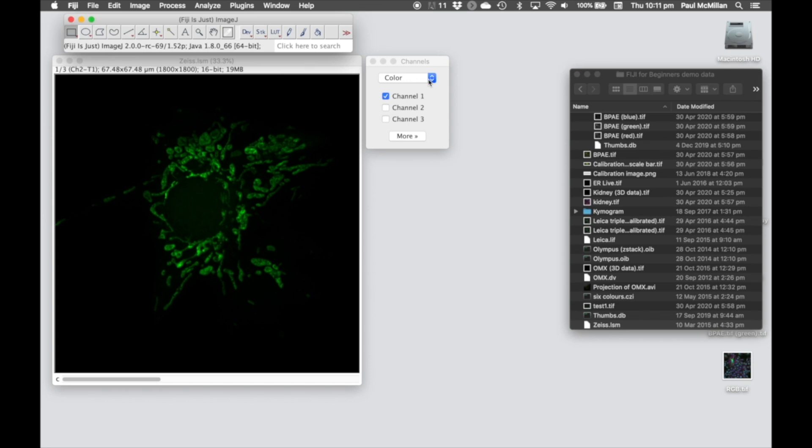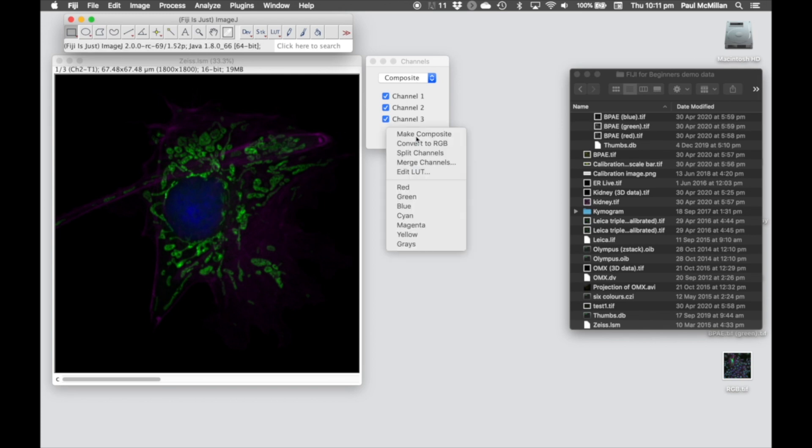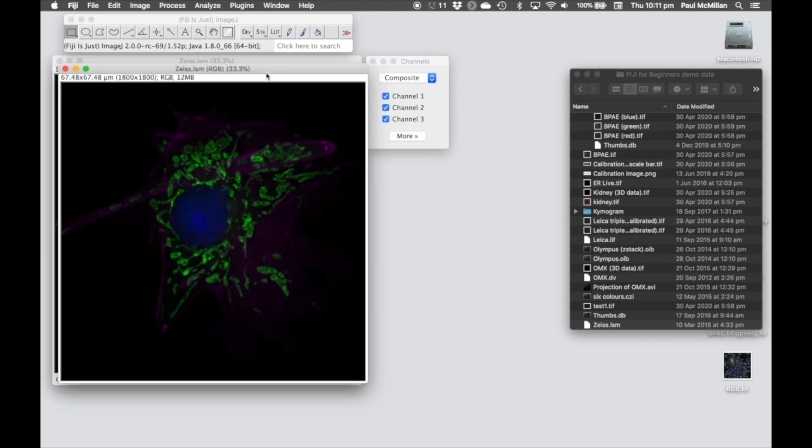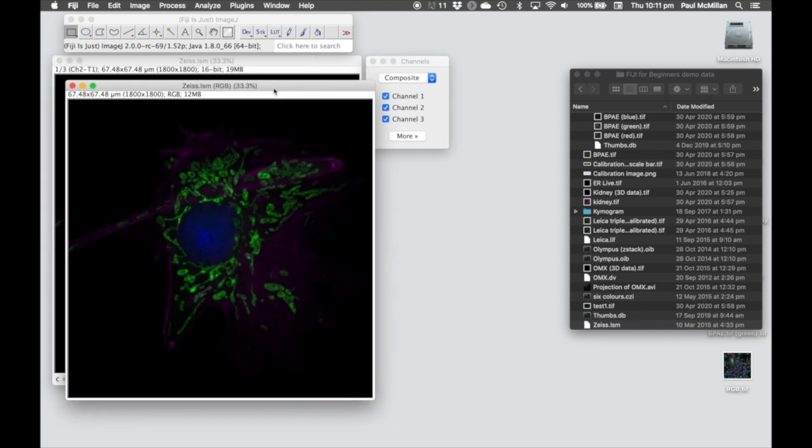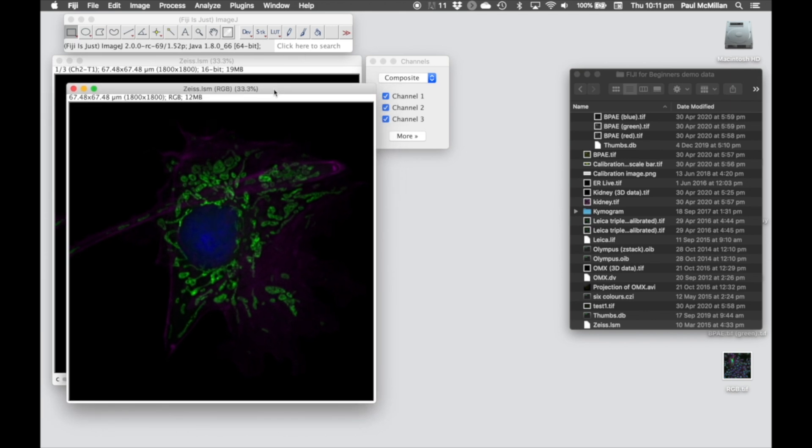Once we're done with that, we can go into Composites. That will show the merge of those, and then we can go in, hit Convert to RGB. That's using the lookup tables that we've now defined to create an RGB image.